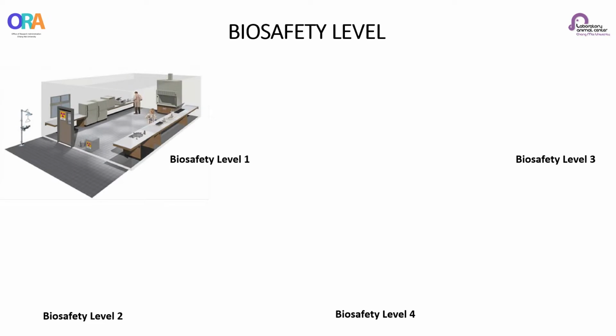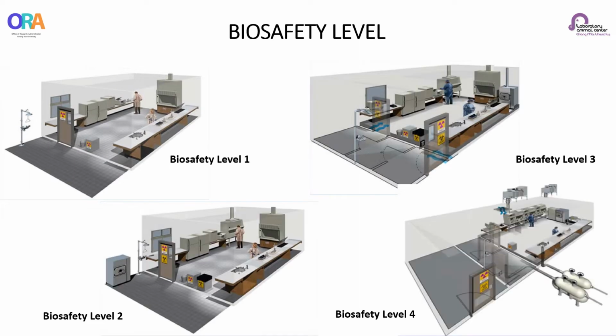Okay, these slides show the BSL levels of laboratory. Each of the four laboratory levels, or the four types of BSL designation, consists of a combination of facility design features and safety equipment, facility practice and procedure, and personal protective equipment.